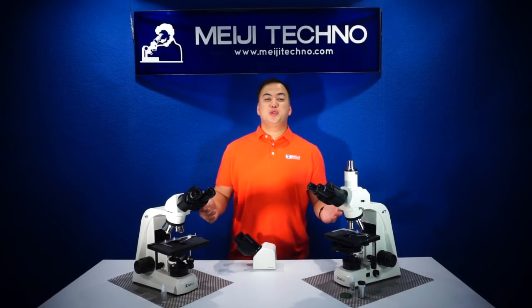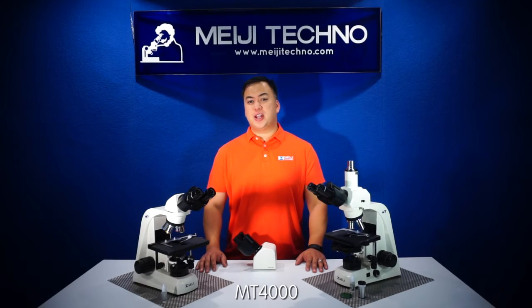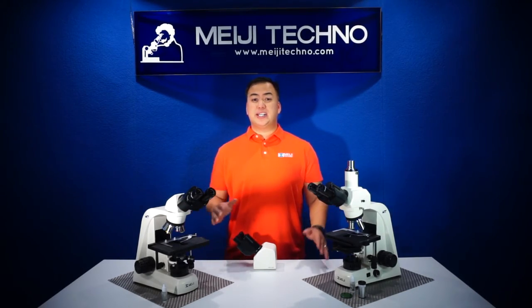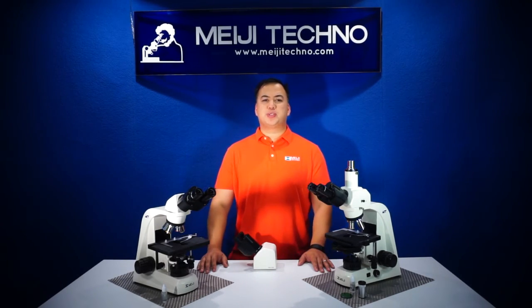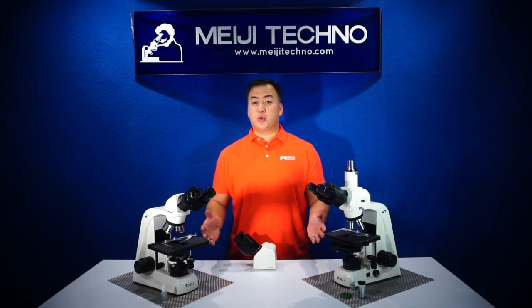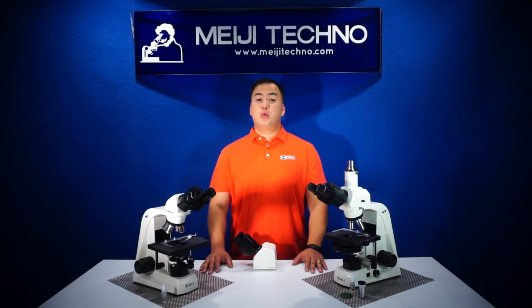Ohayoguzaimasu! Welcome to Meiji Techno. Today we'll be discussing our MT4000 biological compound series. Our MT4000 series is designed to be a versatile modular ergonomic microscope system, ideally suited for use in laboratories, hospitals, educational institutions, research, and advanced laboratory applications.